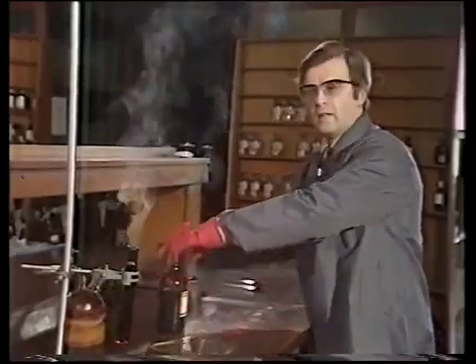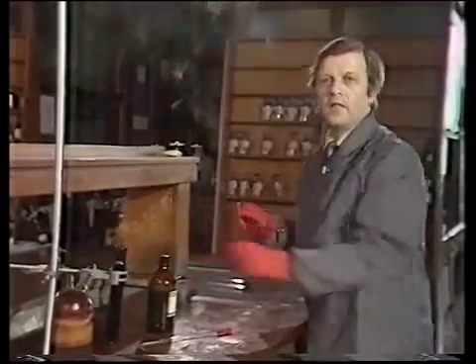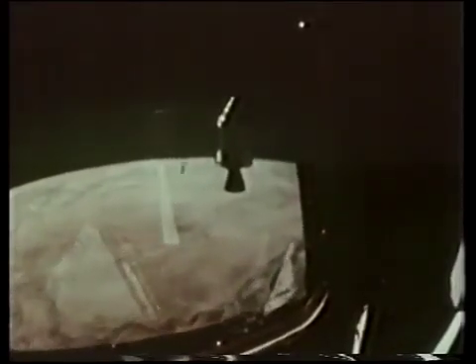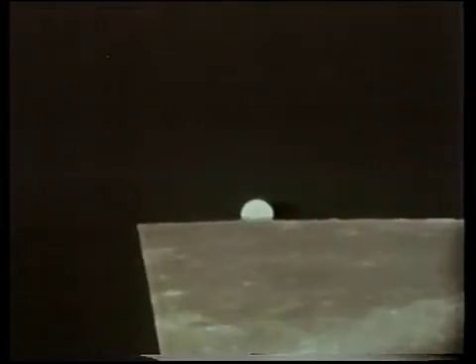And you will see that this particular reaction is very reminiscent of a rocket fuel flame, which indeed it is. However, in the rocket engines which are used at present, aniline is not used as the fuel.